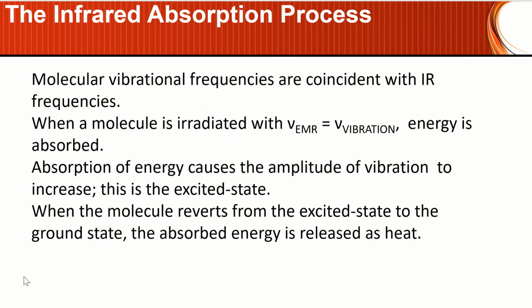So continuing on the IR absorption process, molecular vibrational frequencies are coincident with IR frequencies, as we saw in the video, right? So when a molecule is irradiated with electromagnetic radiation whose frequency is equal to the vibration frequency, energy is absorbed as we saw in the video.